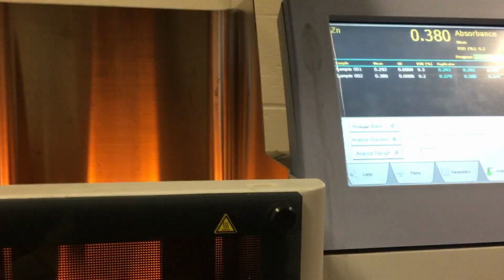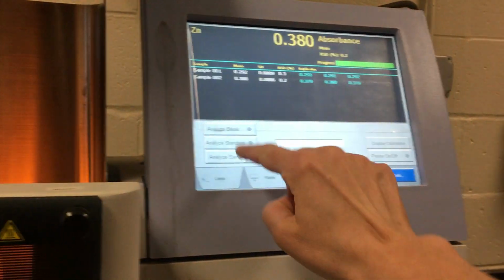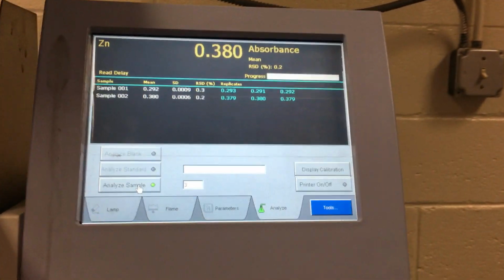Sorry about the bobble. Our second standard is there. Analyze sample.